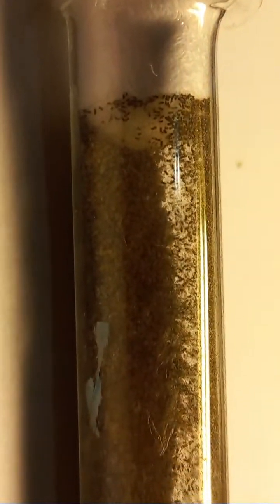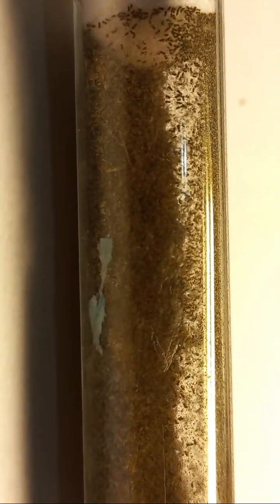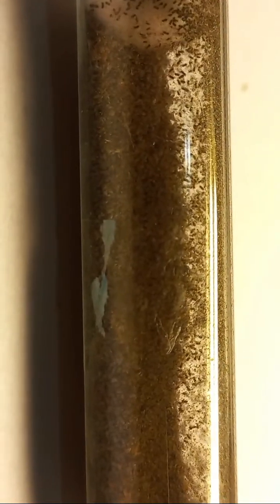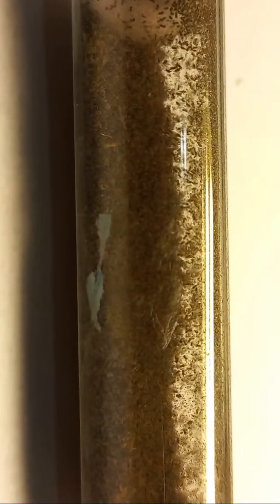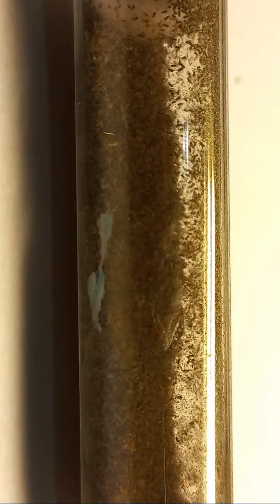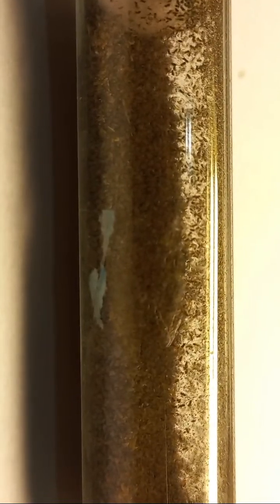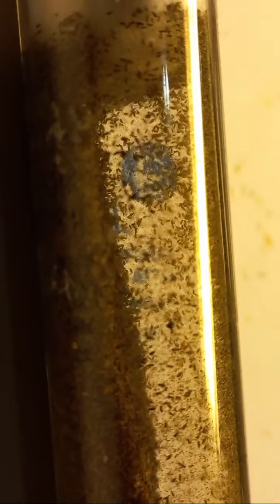They are sitting in different tubes, because they belong to different samples. And here a lot of eggs of grain moth. Yes, a lot of grain moths gave a lot of adults which have been developing inside eggs. That's why they just hatched and are crawling in captivity in a closed chamber inside the last tube. I'm just moving from one glass tube to another glass tube.